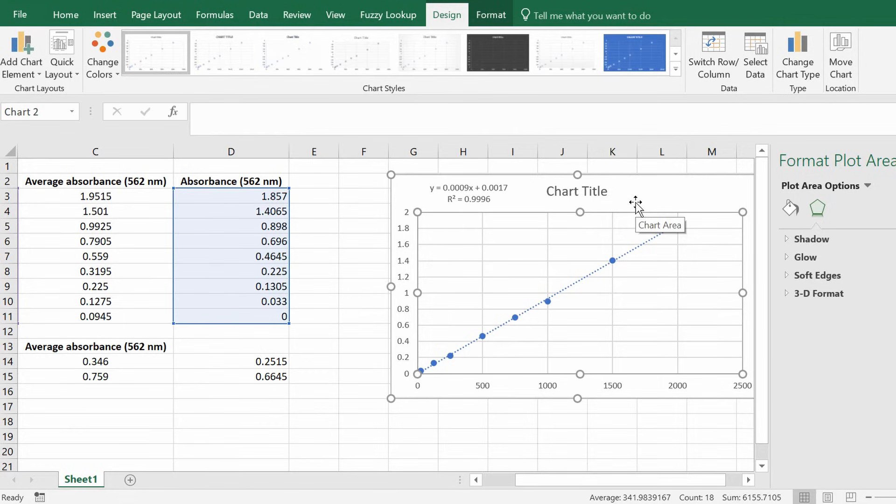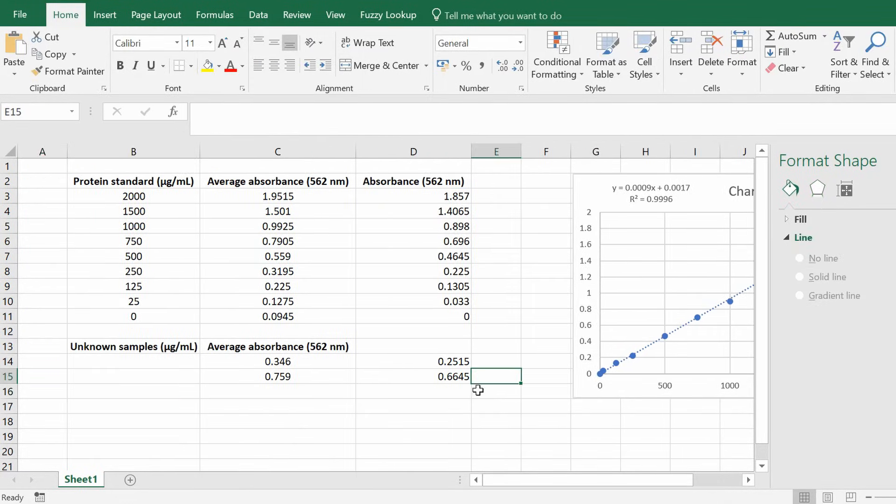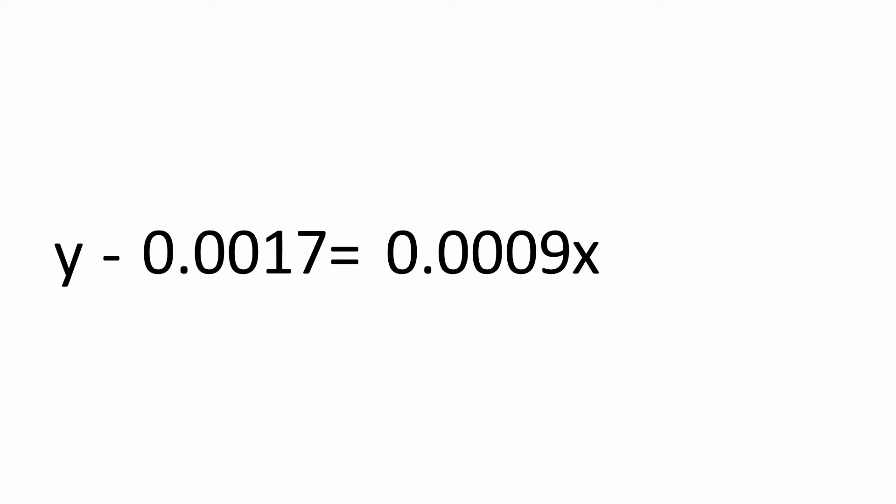The equation in this case is y equals 0.0009 x plus 0.0017. So this is the equation we need to work out the unknown concentrations. Now it involves a tiny little bit of maths here. So simply what you need to do is rearrange this equation to get x on the other side. So to rearrange the equation is you firstly minus 0.0017 in this case to the other side. So doing so would give y minus 0.0017 equals 0.0009 x. Finally all we have to do is to take the 0.0009 over to the other side by dividing this value.